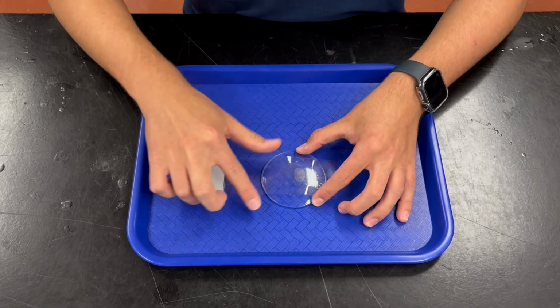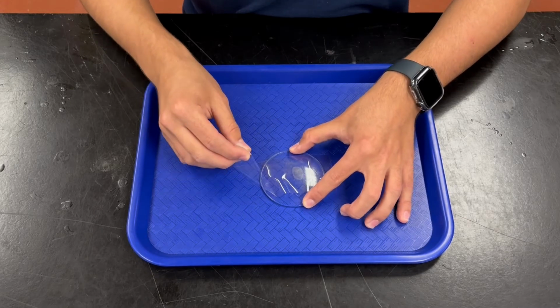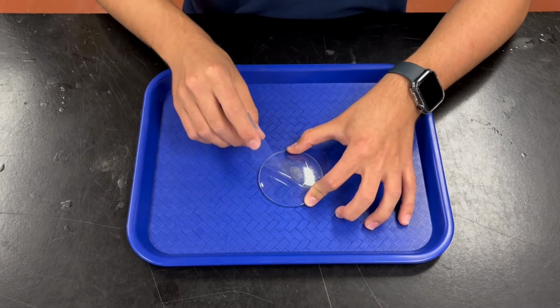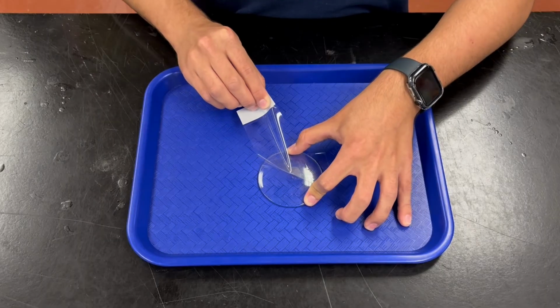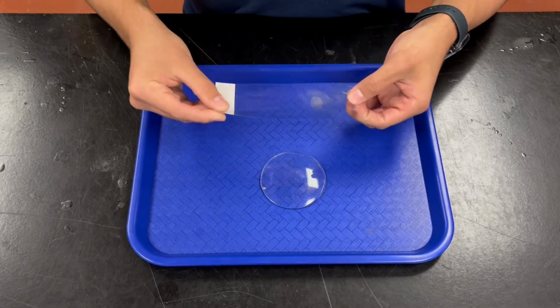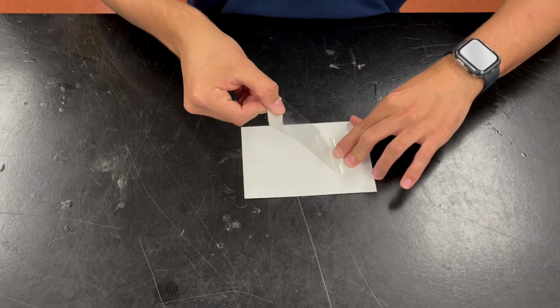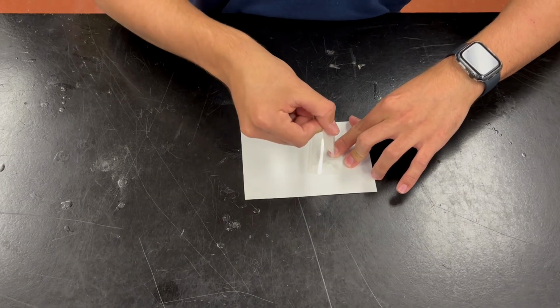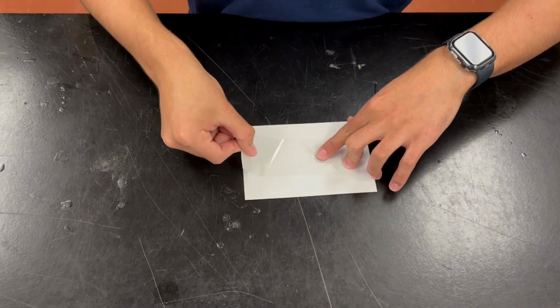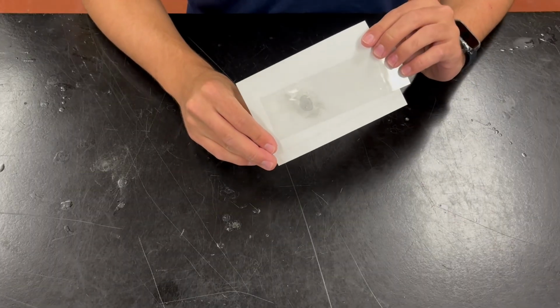If it looks perfect like mine, which I doubt, you can remove your collecting tape. Same. Always start from the corner. You're going to do it very gently, and you're going to pull in one movement. There you go. Now repeat the same process to transfer it to the white card that we picked for our contrast surface, very gently. There you go. And once again, another fingerprint was successfully collected.